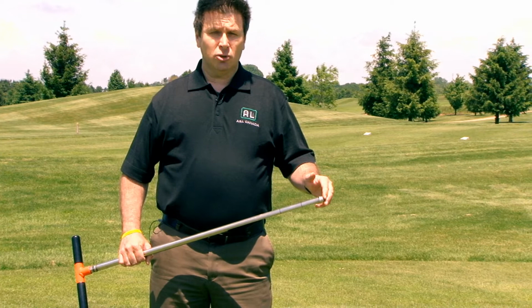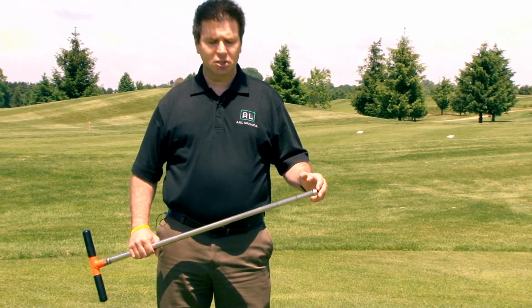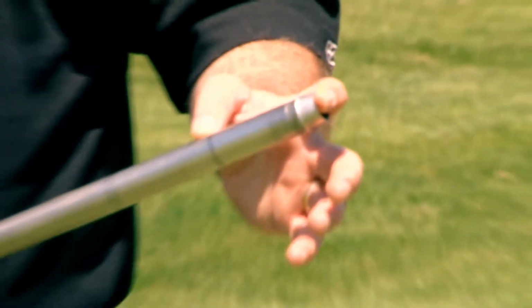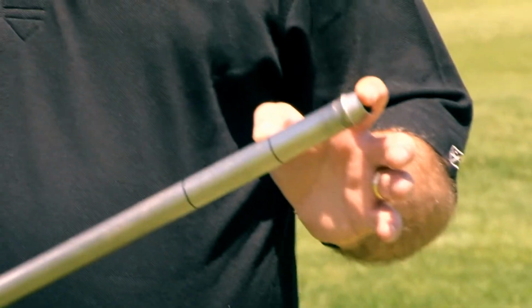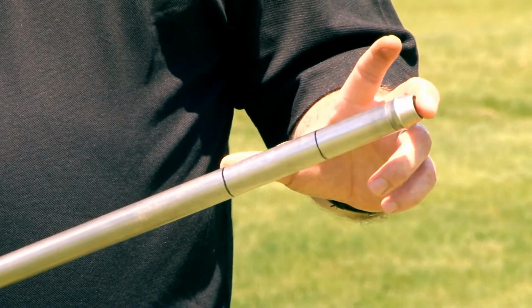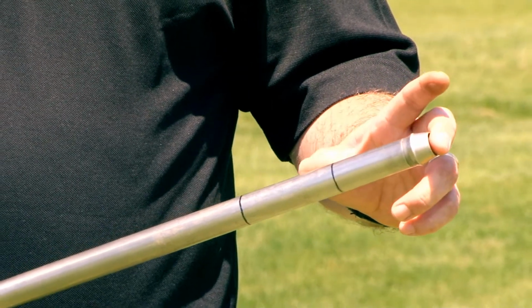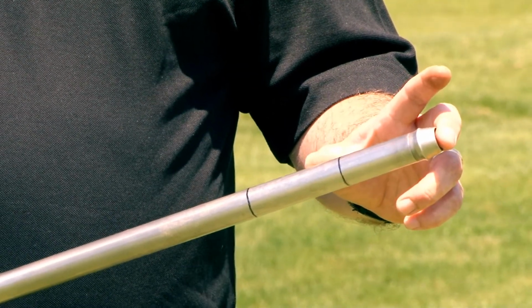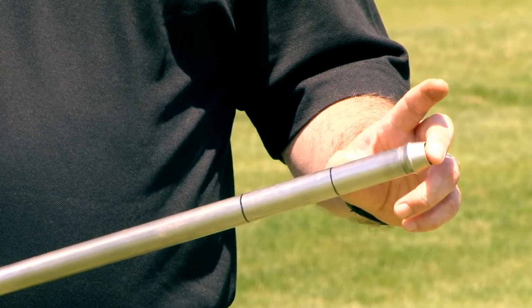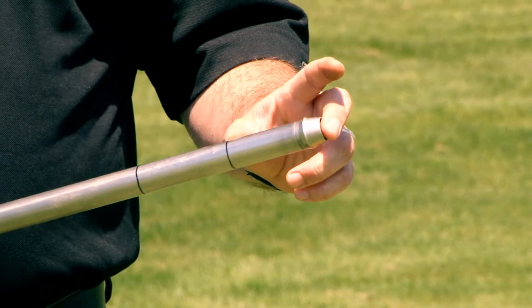When we're taking a soil sample for tees and greens, we want to make sure that we're sampling to about a 2 to 3 inch depth. I've taken my probe here and marked a 3 inch depth with a Sharpie. I've also marked a 6 inch depth. You do 6 inches for more agricultural type soils, and maybe slightly deeper if you were doing lawns and fairways, but 2 to 3 inches is what would be adequate for tees and greens, because that's where most of the root mass is.